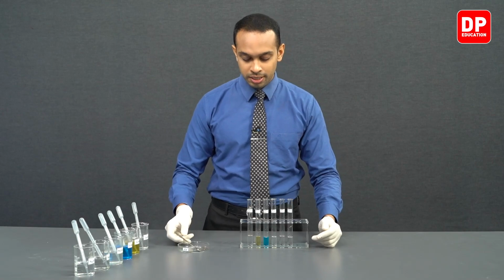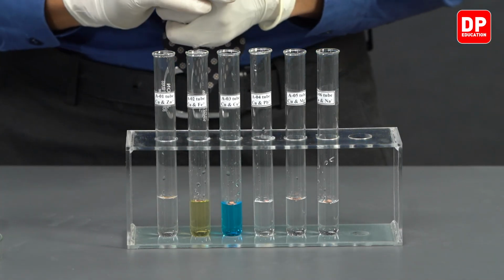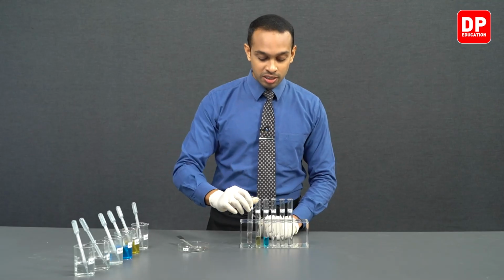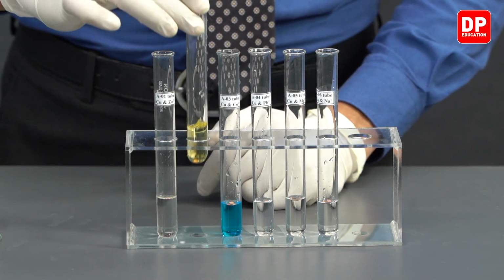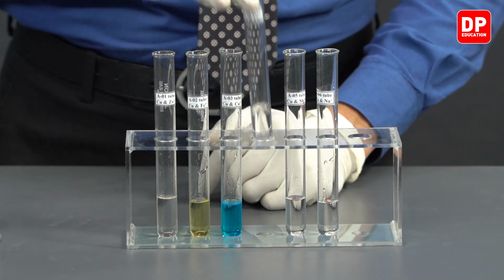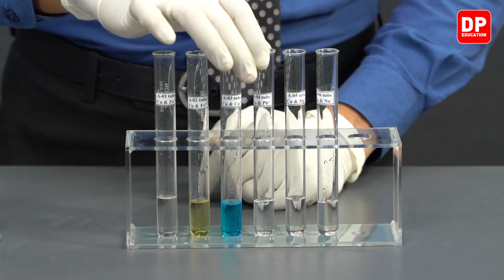We'll take a few pieces of copper metal and add to each of these test tubes. Now students, as you can see, we have added pieces of copper metal to each of these test tubes. To get them to come into contact with the solution better, we can shake the test tubes a little bit, because some of the copper pieces are floating on the surface. So to get them to be submerged in the solution, we can shake the test tubes a little bit.